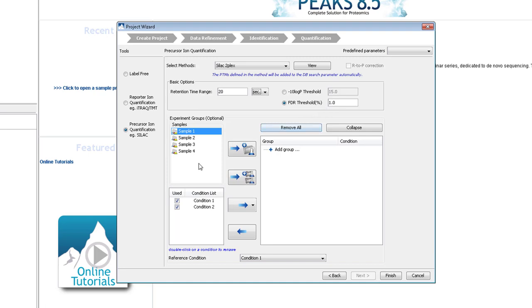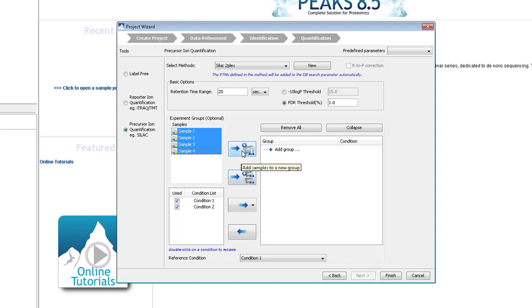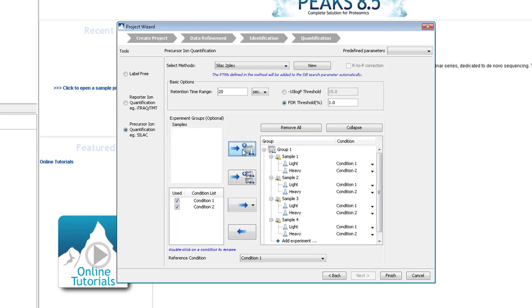Remembering this experiment's design, each of the four samples is a replicate. So, add them all to the same group by holding Shift and selecting all the files. Click the top blue button to add the samples to the right.